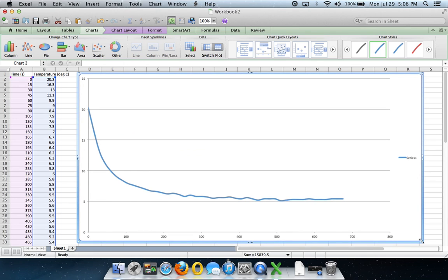Now, as you can see, there isn't a clearly defined plateau anywhere in this region where we can say the phase change has occurred and we're all finished freezing our cyclohexane solution. So we're going to have to extrapolate and figure out where this initial descent would continue on and where this tail, for lack of a better term, goes out. In order to do that, we're going to have to make a trend line that's descending along this initial slope and a trend line along the data coming out here on the tail end.